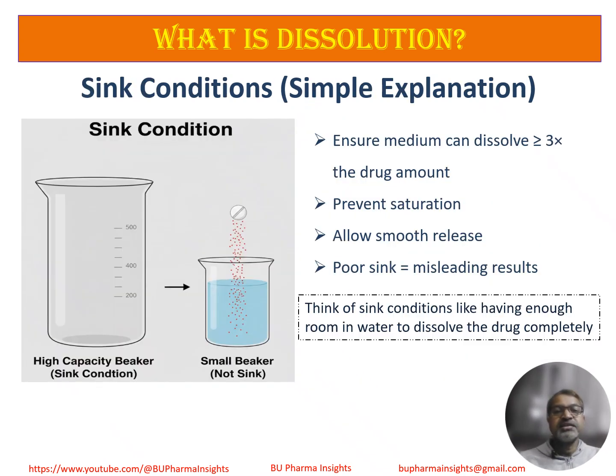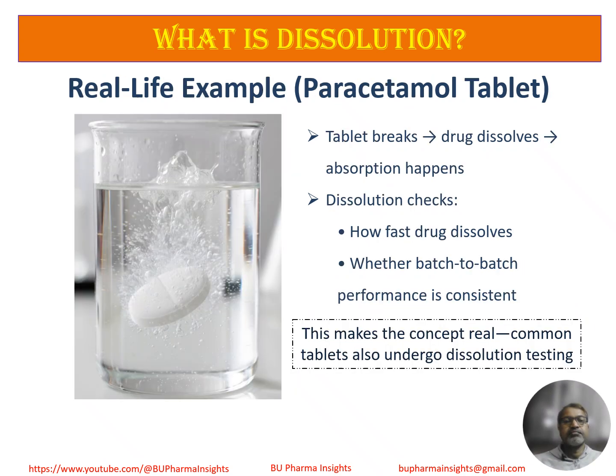Now we'll discuss a bit on sink conditions. A very important concept in dissolution testing is sink condition. This means the dissolution medium must be able to dissolve at least 3 times the amount of the drug present in the dosage form. If the medium becomes saturated too quickly, release slows down and results become misleading.